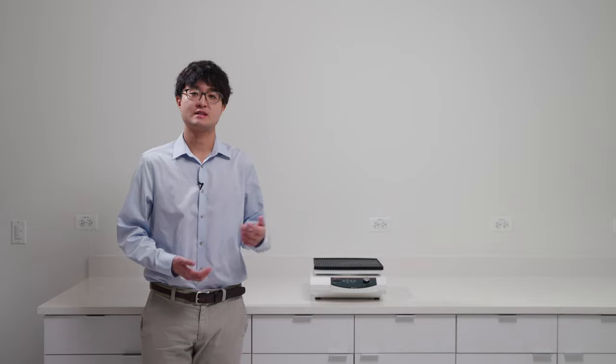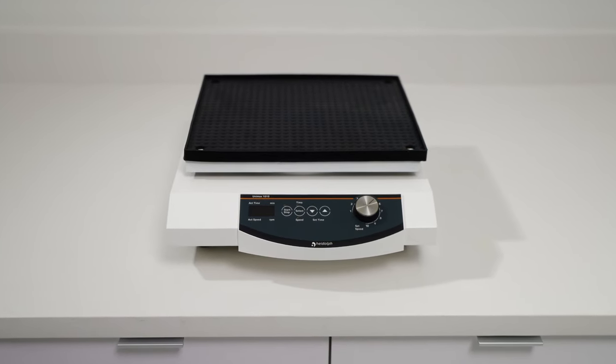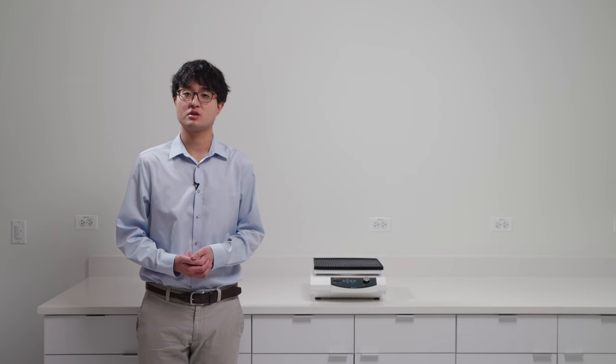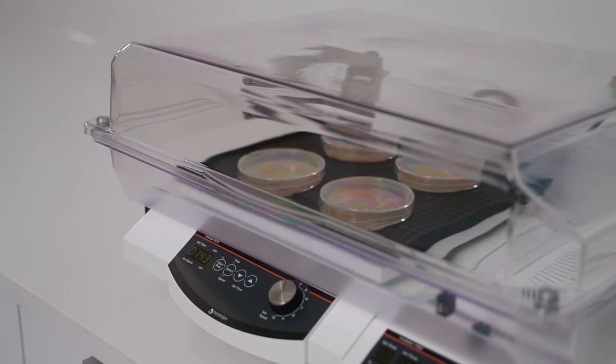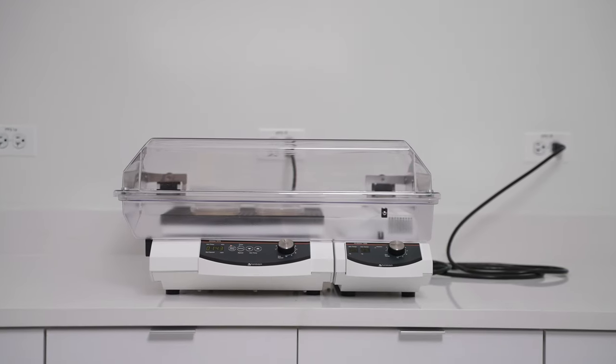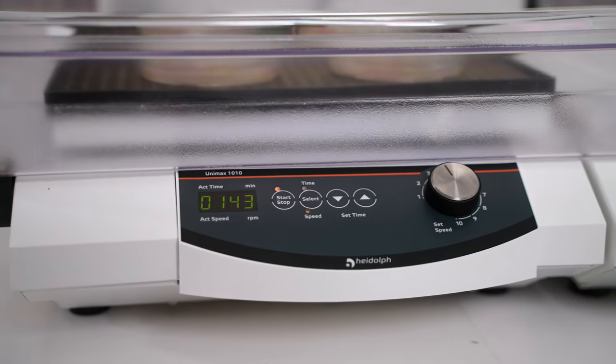If you want something more robust, then we have the Unimax series. The Unimax series comes with two models. Our base model, called the Unimax 1010, comes with temperature control capabilities as it can be converted into an incubator through our incubator accessory. This transforms a regular platform shaker into a platform shaker that is able to do temperature control tasks.